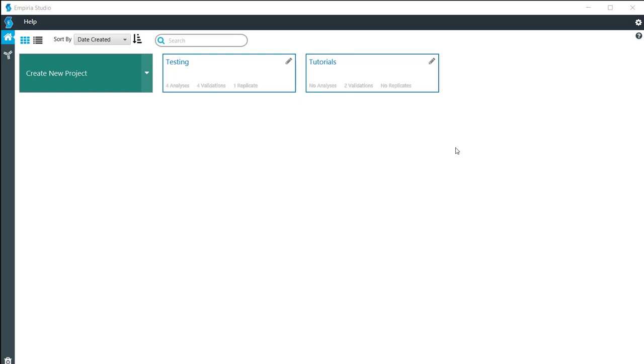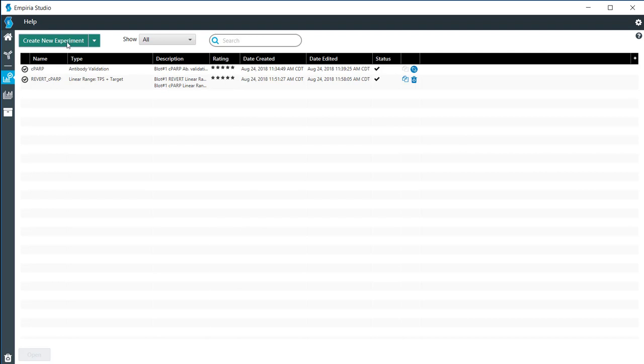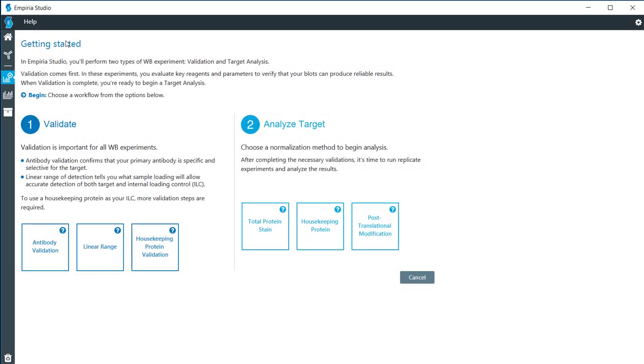In this video, I'll be taking you through the steps of validating your housekeeping protein. So I'm going to go ahead and open up a previously created project, and I'm going to click on Create New Experiment. And from here, I'm going to also go into the housekeeping protein validation.